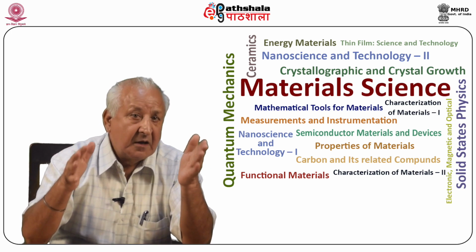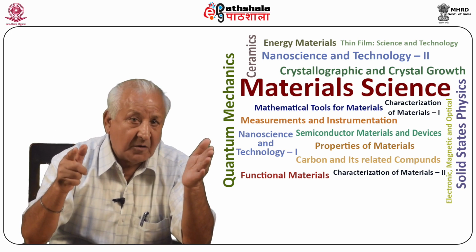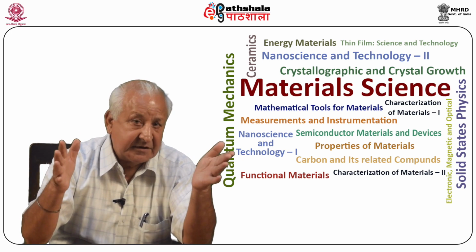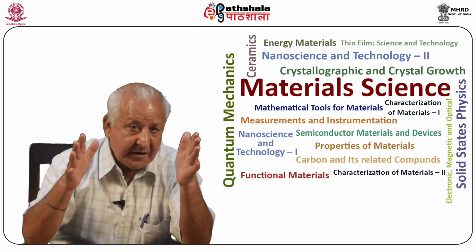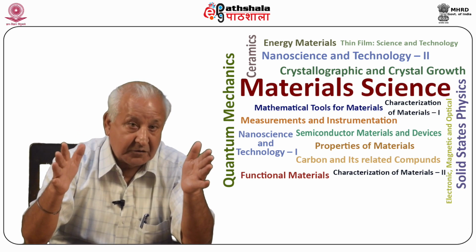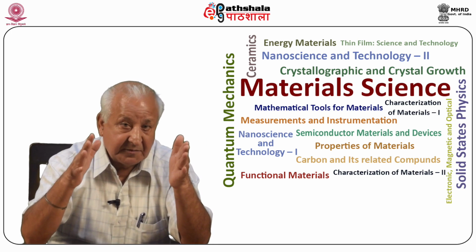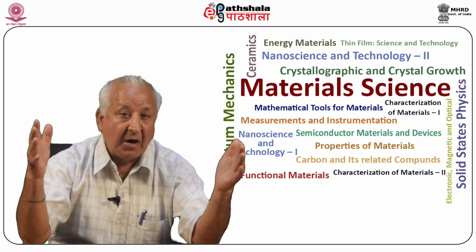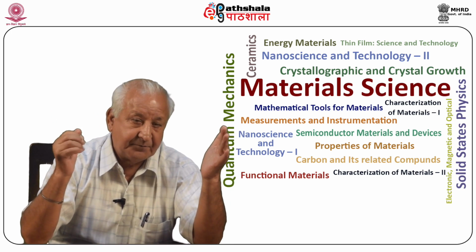Now we shall know about the limitations of the gel method. The gel method of crystal growth has certain limitations which may be summarized as follows. The gel method restricts the size of a crystal. Larger crystals are difficult to grow. There is a considerable possibility that appreciable amounts of impurities may go into the growing crystal lattice.